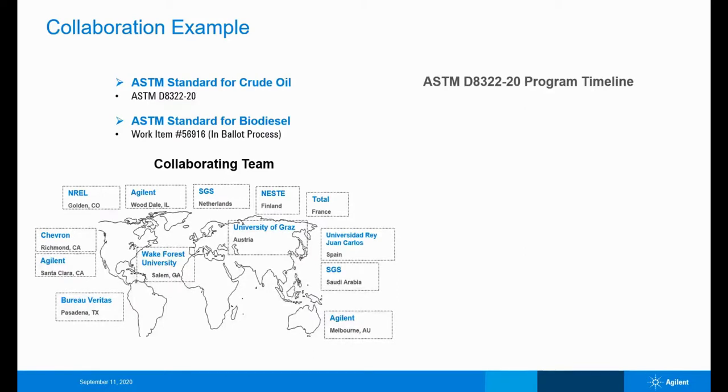And at the same time, a standard test method was in promulgation concurrently with the one that has already been published. So that gives you an idea of the complexity of even using the same platform, the MPAES, to run three different types of fuels.